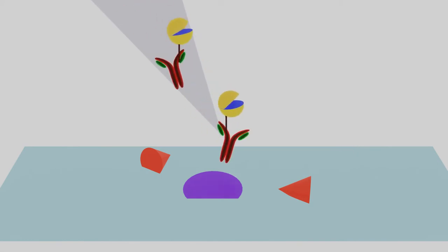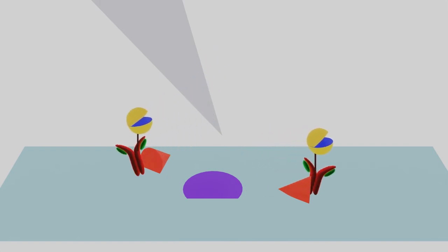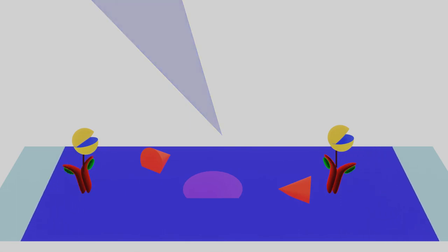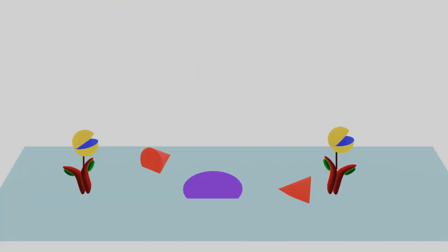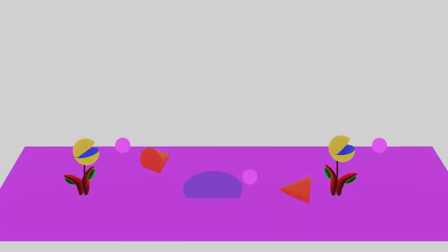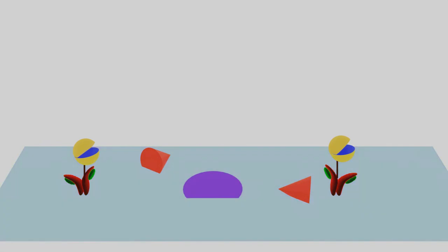When we added the antibody, it can not only bind to the HIV, but it can also stick to the sticky surface on its own, because anything can stick to a sticky surface. This may lead to a false positive, in which you detect color change even though there is no HIV. So how to solve this?